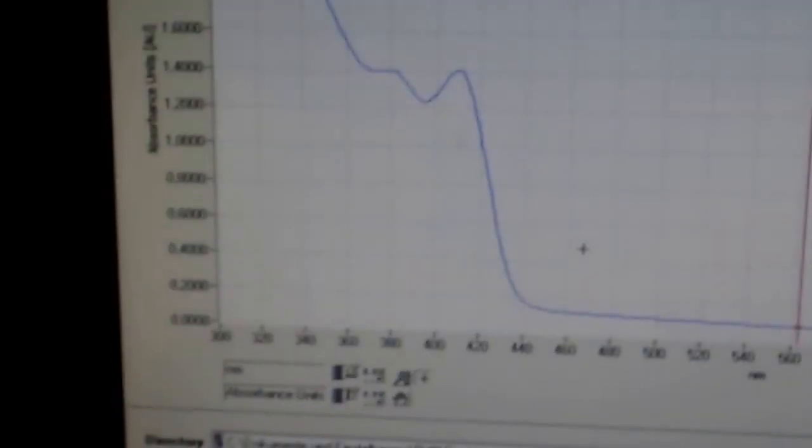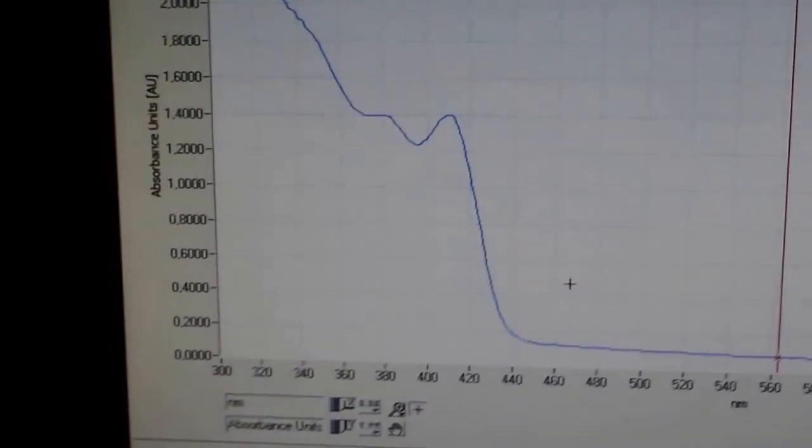And once again, because it was so nice, Michael, let's see again the nice luminescence of these cadmium sulfide nanoparticles. Of course, it's not the blue you like to see, the normal blue, but because they are small nanoparticles, they emit in the UV, in the deep blue. So I hope you enjoyed our session. Yeah, very nice, good result.